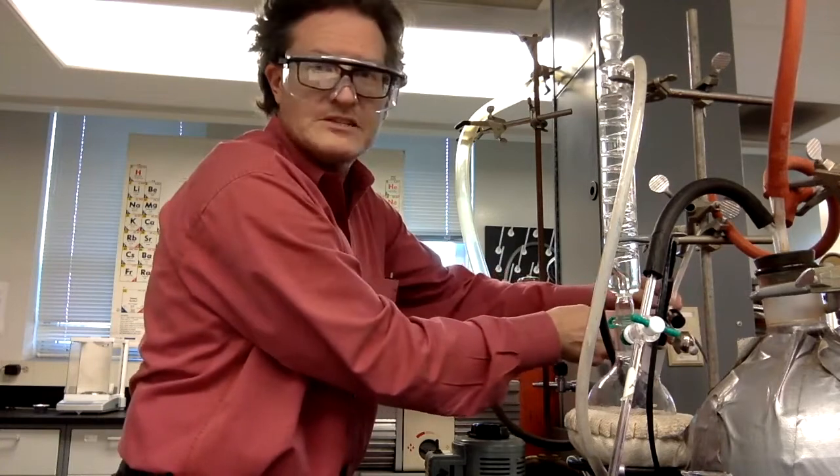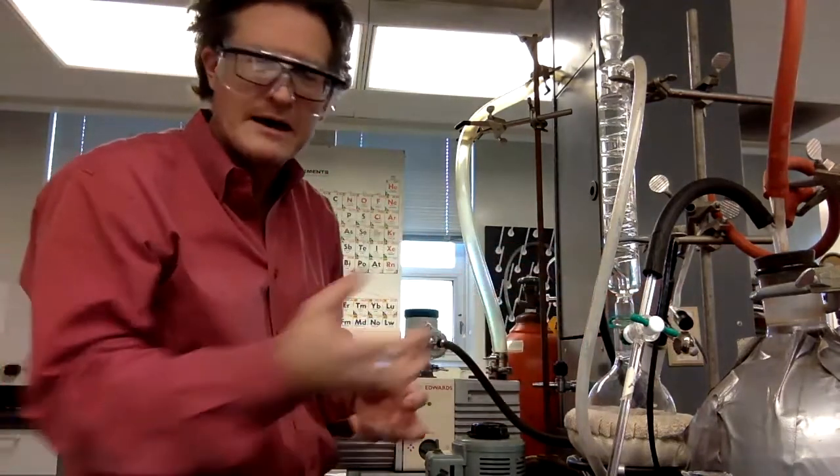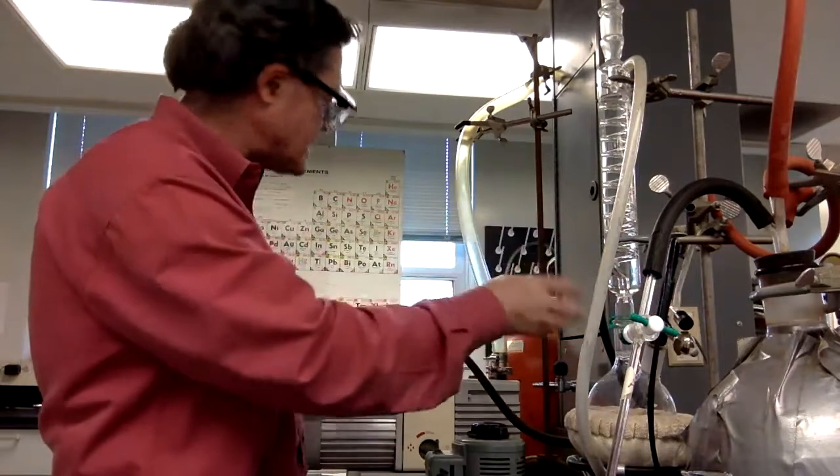But we don't want to open this too far. If you keep unscrewing this, boom, the whole valve stem will come out. And it's supposed to do that, so we can clean it. But we don't want to get it that far out in the leak, right? So we open that a bit.